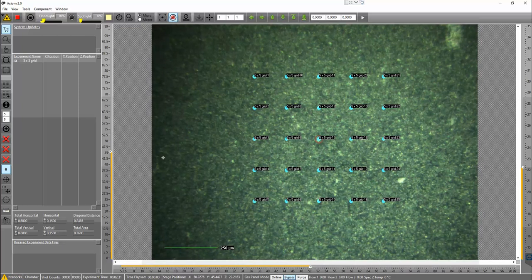Now, also, you can change the orientation to horizontal. So I'm going to change the horizontal direction. Now you'll see that we have 1 through 5 go across the top, and then we're still in the snake path orientation where now it will go down to 6 and then back across. Once again, you can right click and uncheck, and now we see that it's oriented to go left to right for all of the grid spots. And this works for line scans as well.